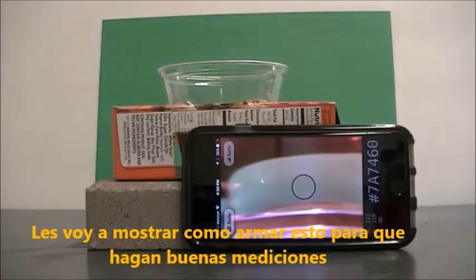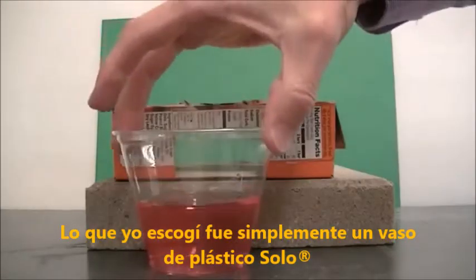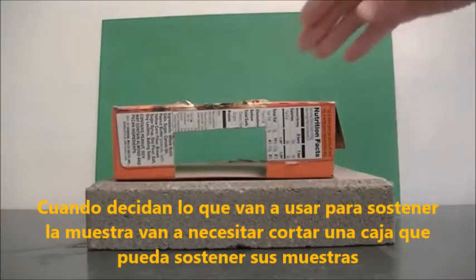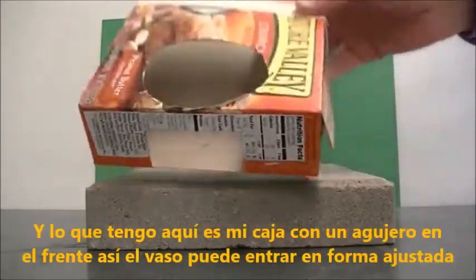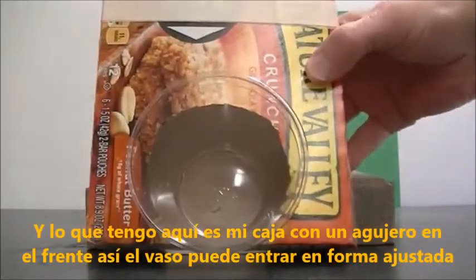I'll show you how to get this set up so that you can take some pretty good measurements. The first thing you'll need to do is decide what you're going to use to hold your samples — I've chosen a solo plastic cup. Once you've decided on your sample holder, you'll need to cut a box that can hold your samples. I've got a box here with a hole cut in the front so a solo cup can fit rather snugly in it.